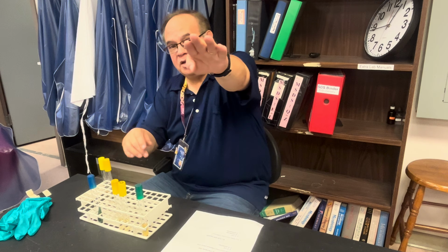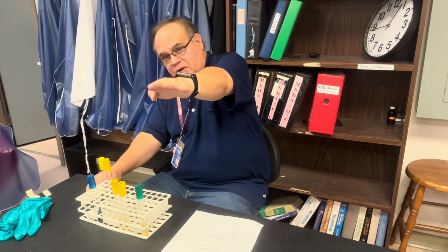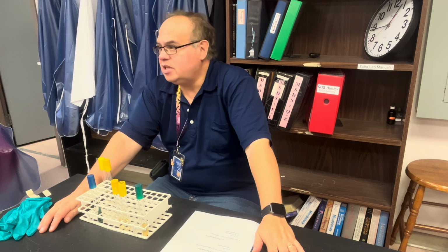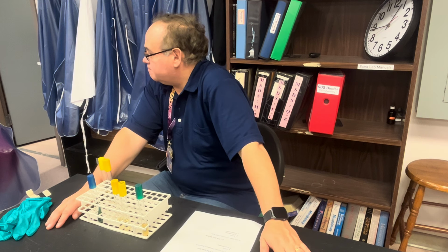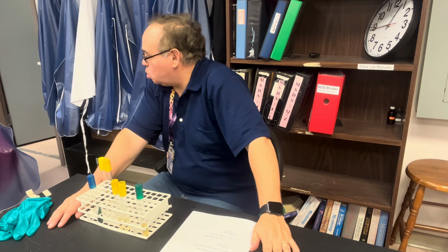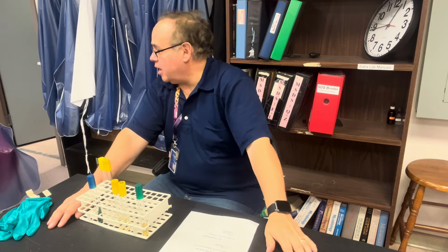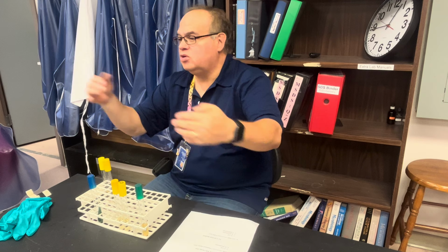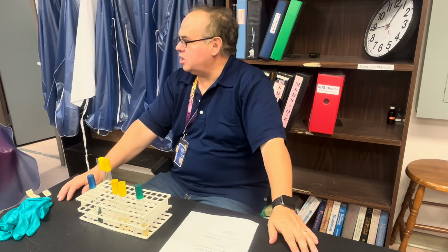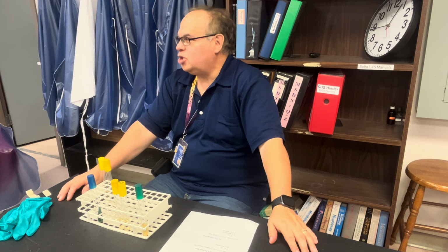So now look at my little chart over there at the very end. You see that positive MR but negative VP means you have an acid end product, right? Negative MR, positive VP means you have a neutral end product. If both are negative, it's not acid, it's not neutral, it's basic. And if both are positive, it's usually going to be that you have an error. But you have to be careful.